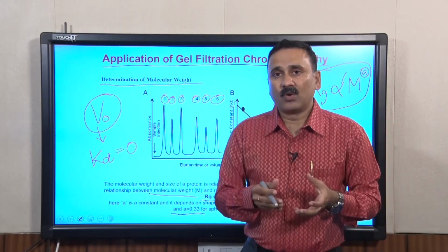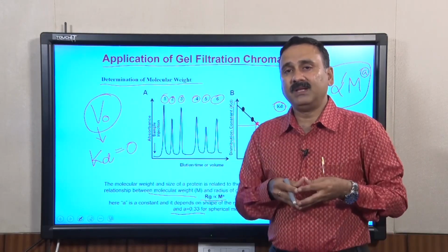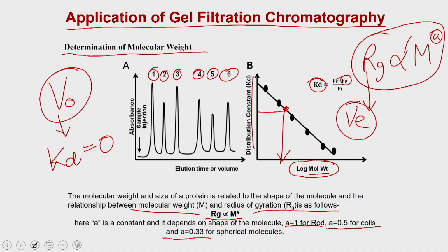So, if you take any protein which is fibrous in nature, what is meant by fibrous in nature is that it is going to be of an extended conformation. Suppose you take your hair, the hair is of fiber-like structure, that is why it is known as a fibrous protein. A fibrous structure is not going to enter into this particular bead irrespective of the size.